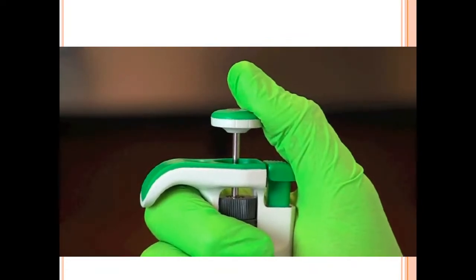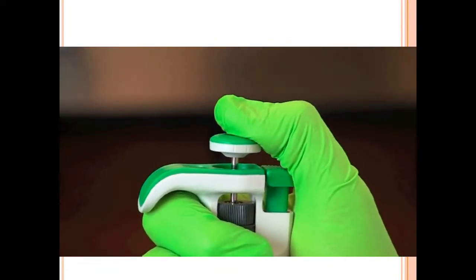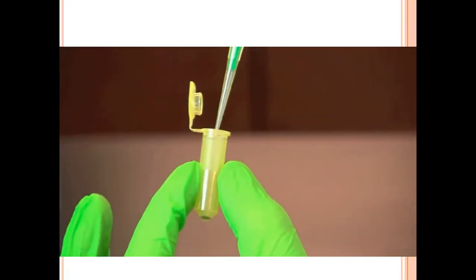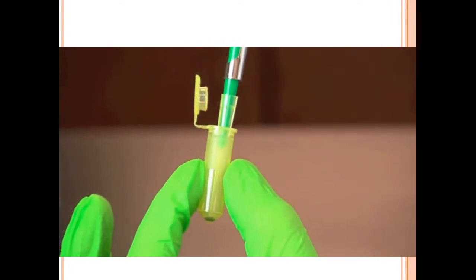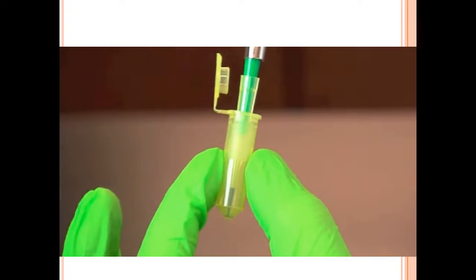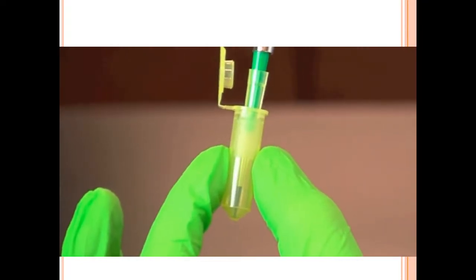To obtain a DNA sample, slowly depress the plunger on your adjustable micropipette to the first or soft stop. Holding the plunger down, insert the tip of the pipette into the microtube with the DNA sample. Place the tip close to the bottom of the sample, then slowly release the plunger button. When loading the samples, keep the pipette tip perpendicular to the row of wells. This will reduce the risk of accidentally puncturing the wells with the tip. Lower the tip of the pipette until it breaks the surface of the buffer and is located just above or just inside the well.